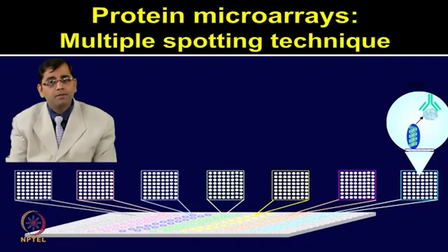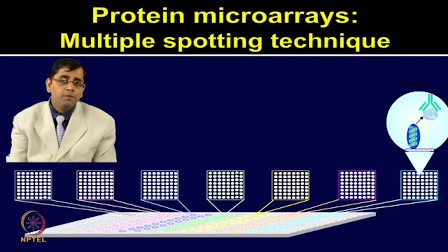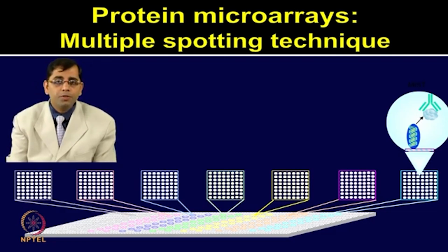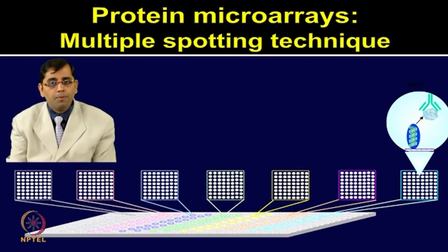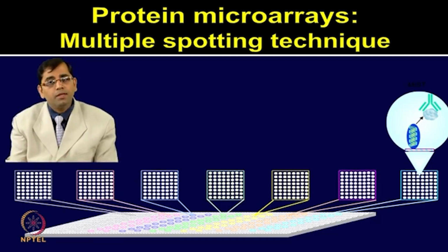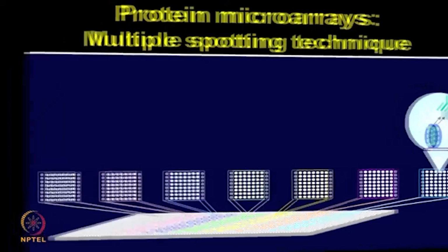Another cell-free expression method tried to overcome some of the limitations of the previously used methods, and it tried to print the cell-free expression system as well as cDNA on the chip surface by using a multiple spotting technique. MIST involves in situ cell-free expression of unpurified PCR products, and cell-free lysates are printed on top of the first spot, so that both in vitro transcription and translation can be performed on the same chip surface.